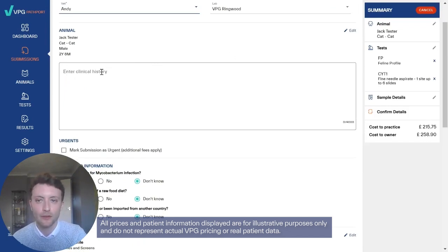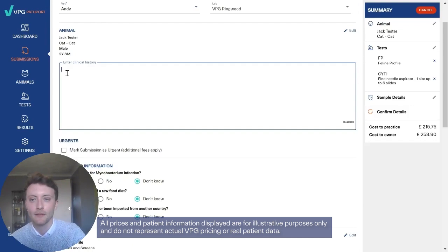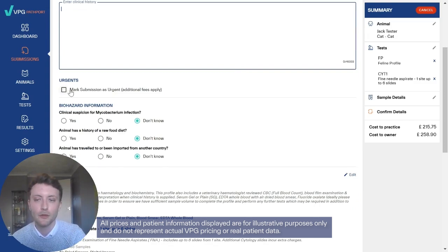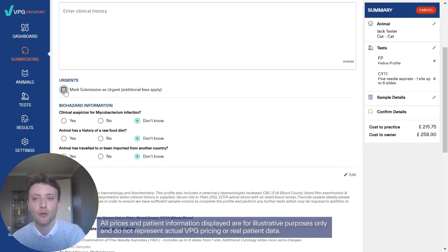Your clinical history for the case can be entered here. Next, you can select whether the submission is urgent or not. Hitting this checkbox will apply the appropriate urgent codes to all tests on your submission.